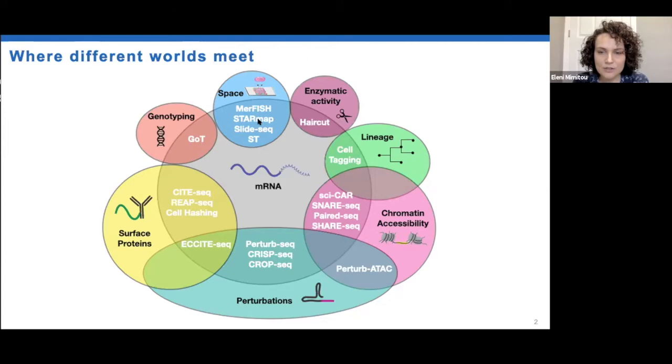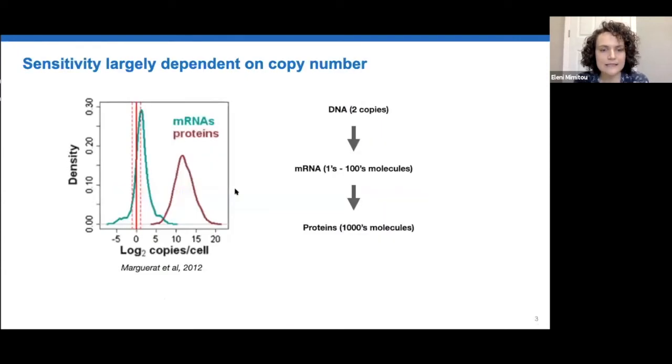In the Technology Innovation Lab, we have been interested in integrating protein detection with single-cell RNA-seq workflows. And we find proteins attractive because they can be diagnostic of cell types and phenotypes, but also importantly, due to their high copy number, they make an easily captured high coverage modality that could complement the usually sparse single-cell data. And this way, we can enable more robust cell type discrimination.